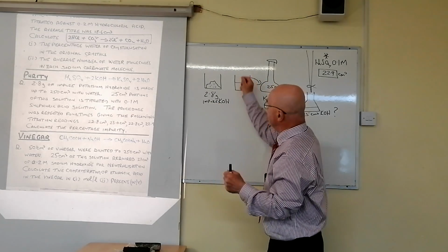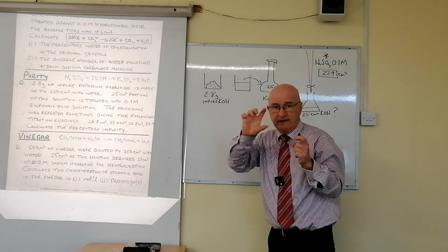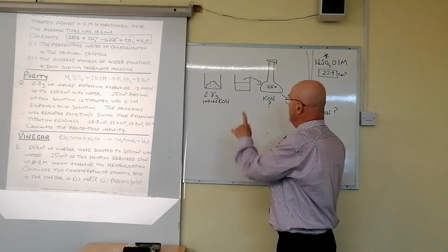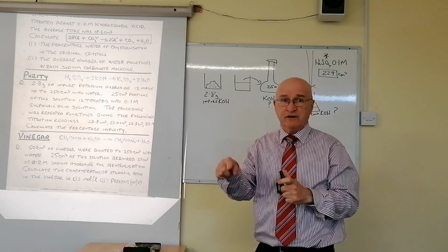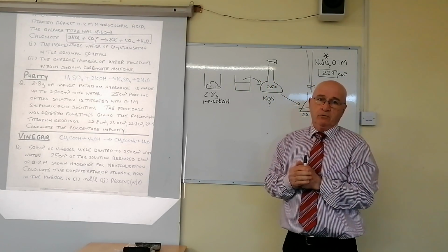Okay, you transfer the solid into the beaker, which is up on the scales, and you're doing that with a spatula, a little chemical spoon. Next thing, you would add deionized water, and please say deionized water, to the beaker, and stir it with a glass rod. Don't just say stir it with a glass rod; say until it all dissolves. Okay, that's what you do.